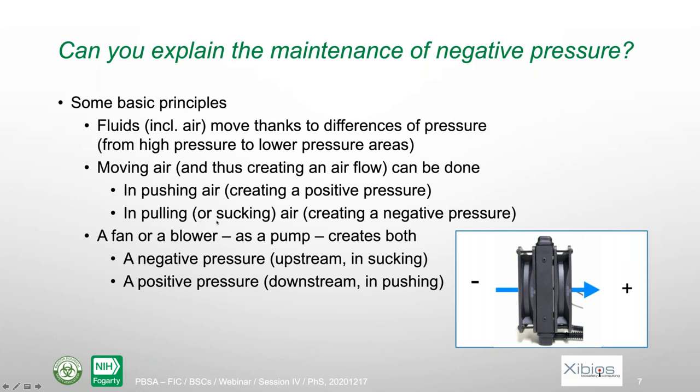And in that case, since we suck, we create a negative pressure. And actually a fan or a blower and a pump for liquid creates both a negative pressure and a positive pressure. You see here the fan. The fan is moving, so we bring energy there to move a fan inside there, and the air is moving from the left to the right. This part is in negative pressure, and the air which is pushed there is in positive pressure.